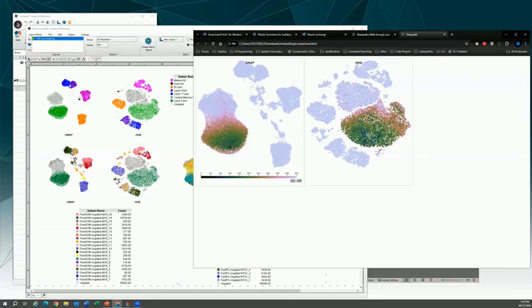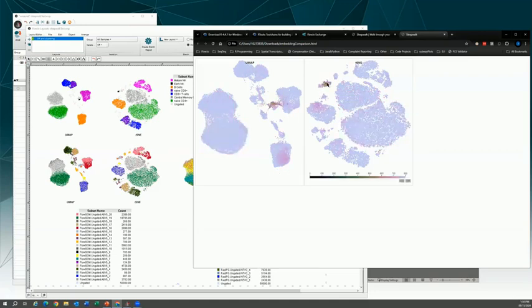So it can help you interpret your manual gates and the embeddings. And again, there's other methods, right? There's TriMap, there's PaCMAP. So some of those might really pull apart and show some local structure that maybe you want to dive deeper into with your particular data. So it can just help you understand if one embedding might do a better job of capturing that type of information that you really want to show to people.